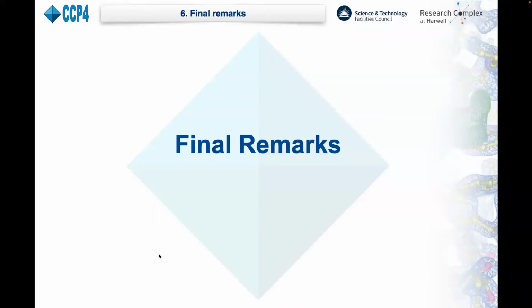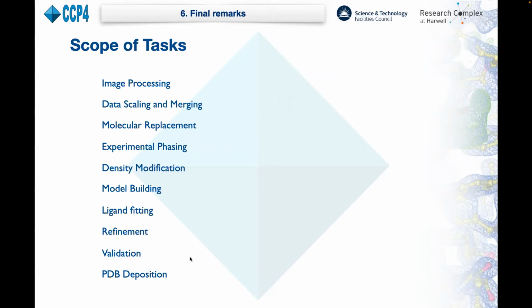Right. So this presentation aimed at giving just the basic knowledge of CCP4 Cloud, its operation principles and scope of possibilities. There are many details and features of the interface and of the cloud which we did not cover and could not cover in a short while in this webinar. But it is expected that they can be discovered and learned in the course of working with the system independently. And therefore, I would like to finish this presentation now with some general remarks.